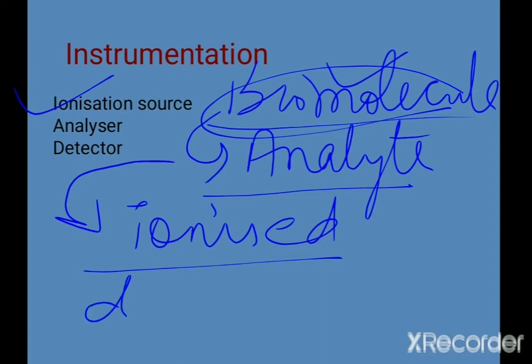So molecular ions are finally generated. So in the ionization source, we make emphasis on creating the molecular ions of various charges.